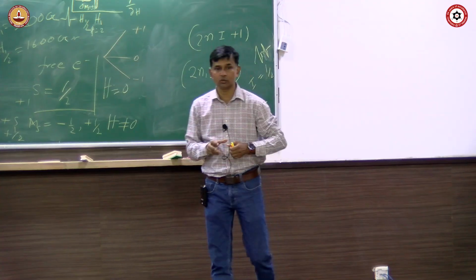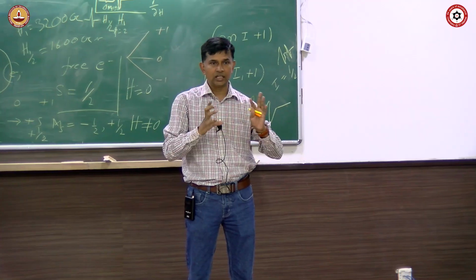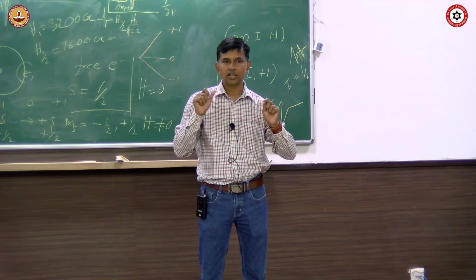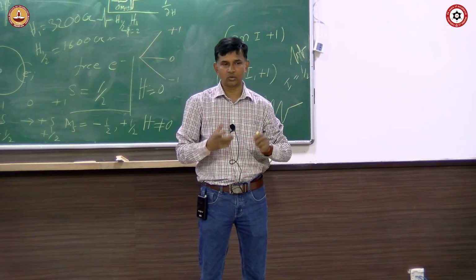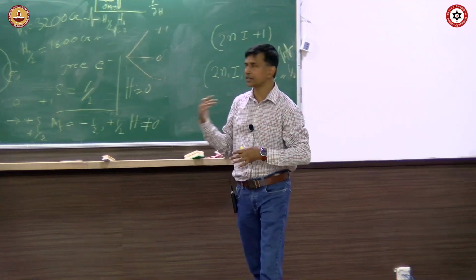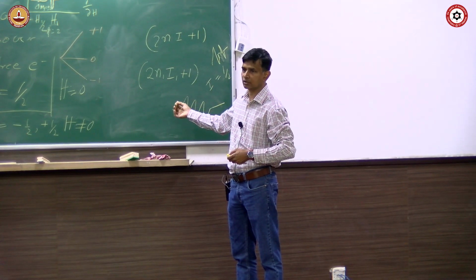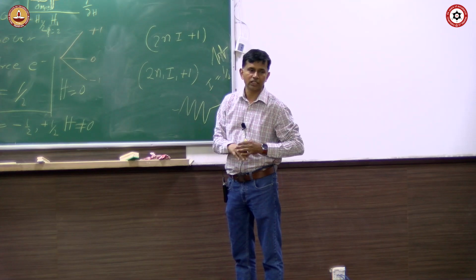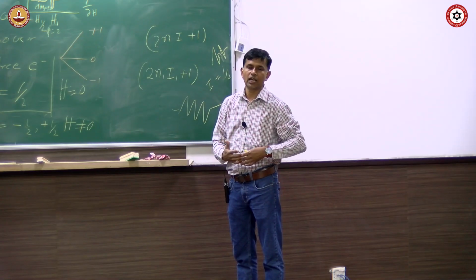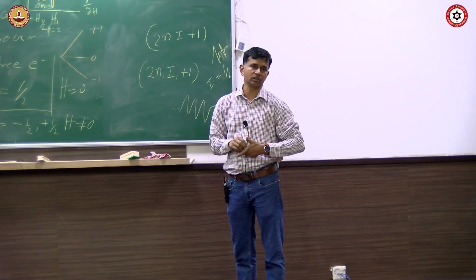So that's the point I told you. You take a balloon and try to squeeze it any way you want to deform the shape. Every time you squeeze, at some point stop and take a picture. Another you keep on doing, ask some guys to take pictures, and you see what shapes you are making. When you make compounds of metal complexes or organic radicals, you see the distribution of the spin densities is very different, and you can have many ways of keeping the same spin.